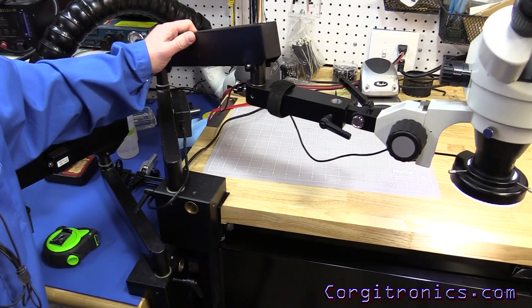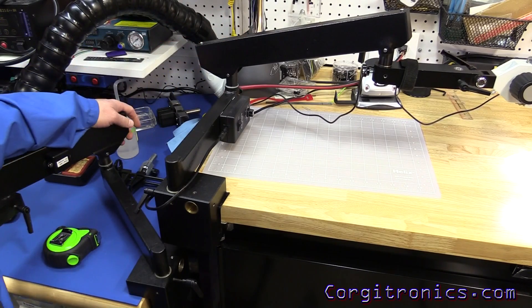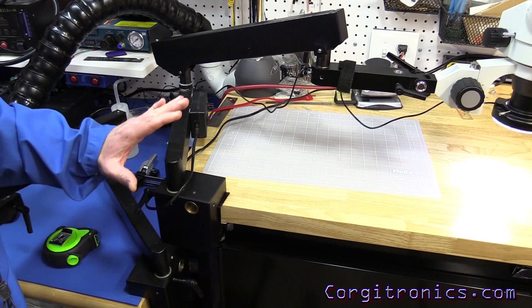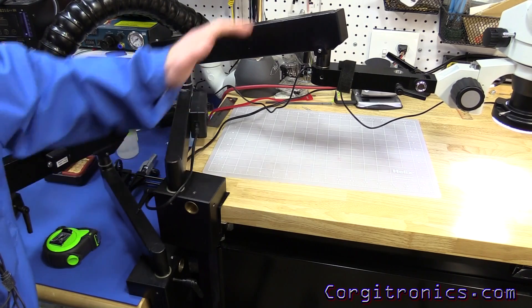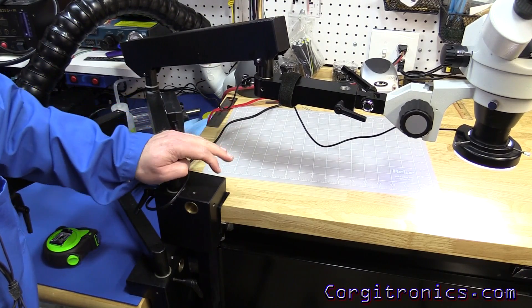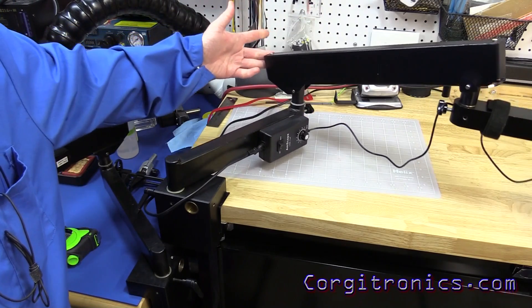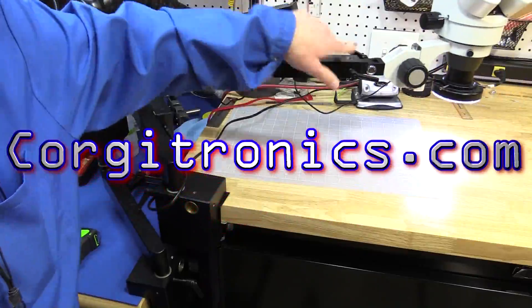I like this mount a lot — it has worked very well, and like I said, I bought a second one. They're very stable as long as you put them on a solid surface. You'll need to grease the pivot points once, but don't use an oil — use a grease. I use a medium weight synthetic grease used in tooling and firearms. Pick something that'll stick and it should be no problem. You can see mine glide quite well, even with the heavy Amscope Trinoc mounted on it.